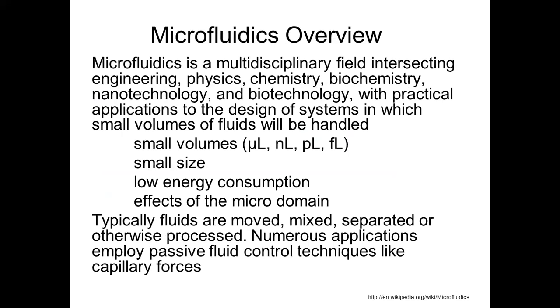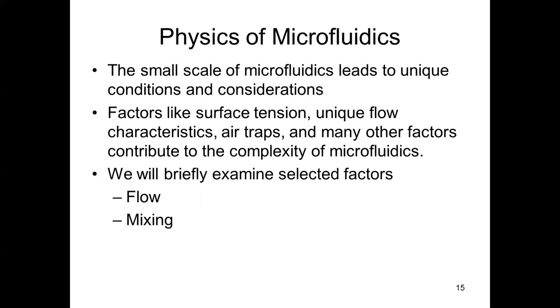So they use low energy, and the effects that this tool takes place in are in the micro domain. Typically fluids are moved, mixed, or separated and otherwise processed on a chip. Numerous applications employ passive fluid control techniques like capillary forces, especially in paper microfluidics. The size of microfluidics leads to unique conditions and considerations.